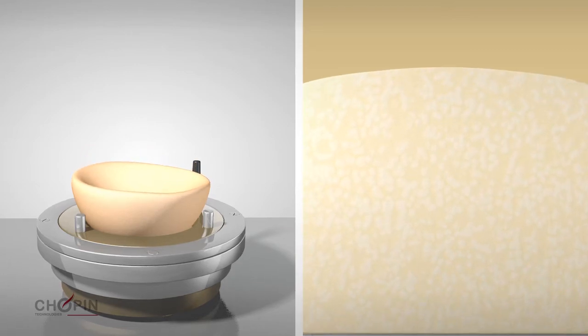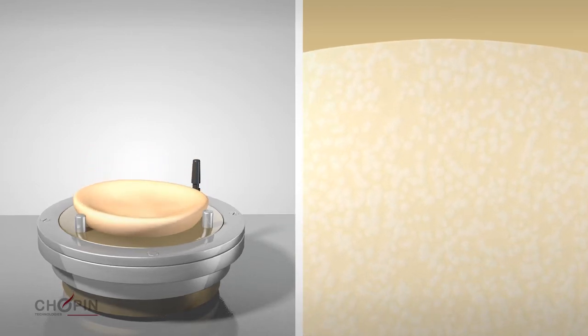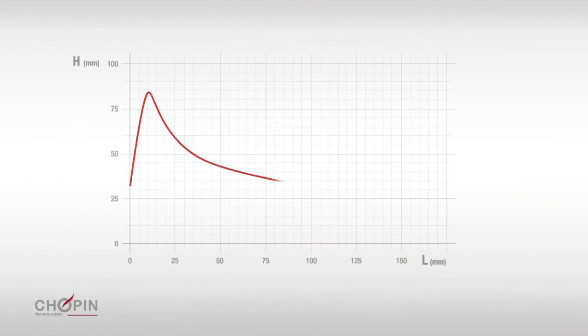The alveograph can be used to analyze all types of wheat: soft, hard and durum. It provides four key measurements.